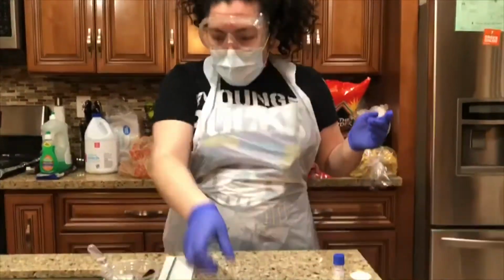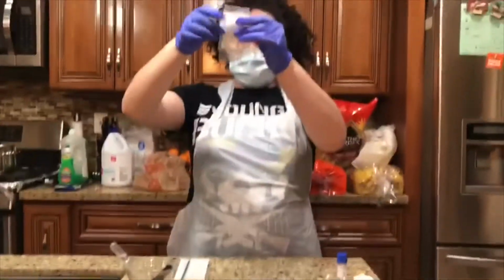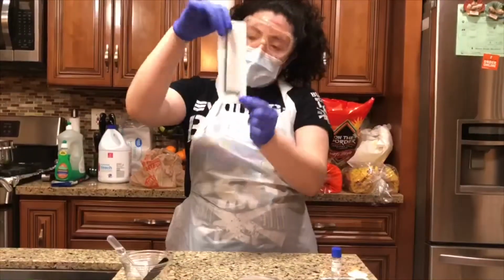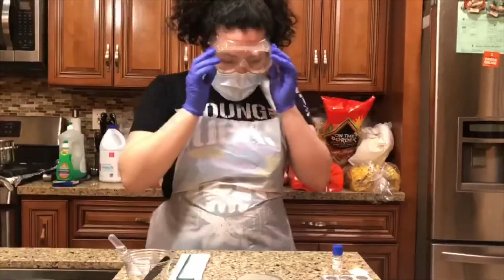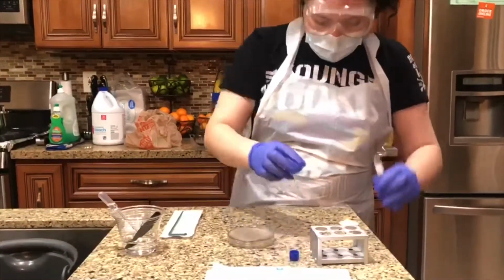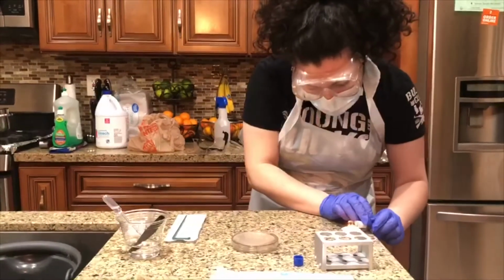And then I have my pipette in here with my tweezers. I have my antibiotics here. And then I have this thing to spread out the active culture as I'm doing this whole process. I'll show how to do that, okay? So what I'm going to do first, I'm going to get my active culture, remove the cap, and then light up the lip of the culture to sterilize it, okay?